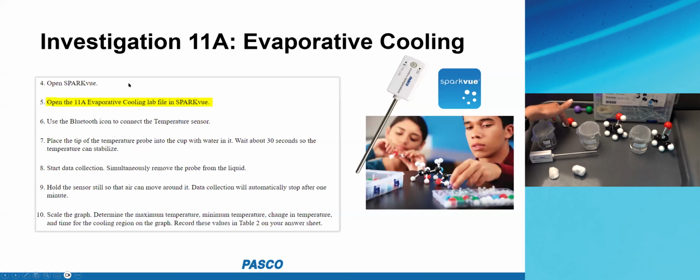Does it have anything to do with the molecular structure? By the way, the molecular model set is one of the parts of the equipment kits that you purchase. Actually, 2 of the 3 will include the model set. So students further in this lab will go on and build the models of the molecules and look for patterns.